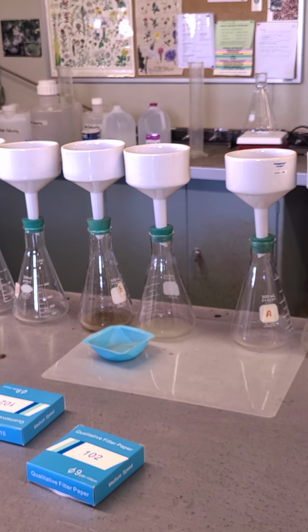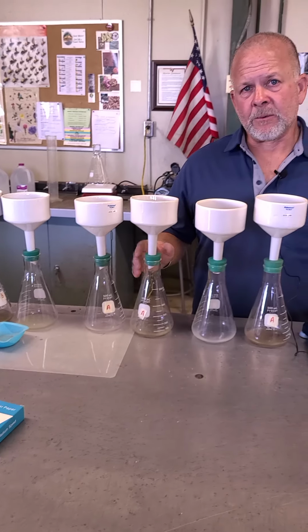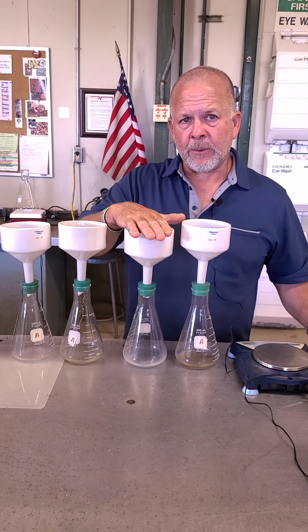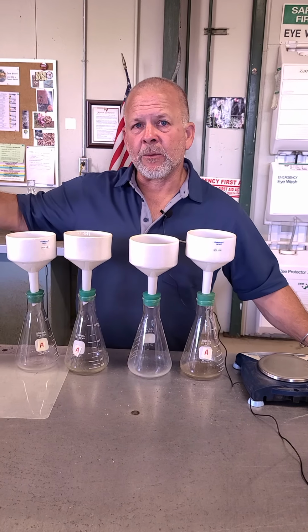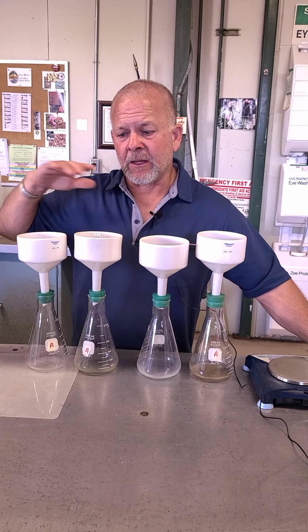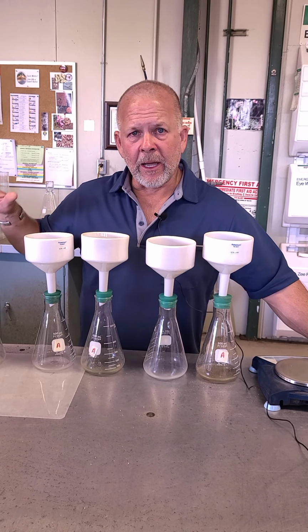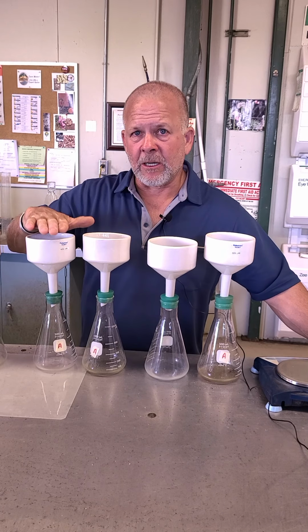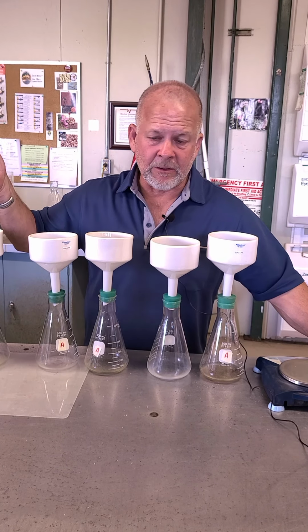So it's okay for it to all drain through and sort of prepare the soil, if you will. So what we're going to do after this is put water on top of this. We're going to fill these beakers up, or these Buchner funnels up, with water, all to the same level. We're going to try to maintain what we call the same head, a constant head on them. And we're going to go back and forth, and as it drains through, we're going to keep filling it up so it's pretty much almost at the rim here, like getting close to flowing over.